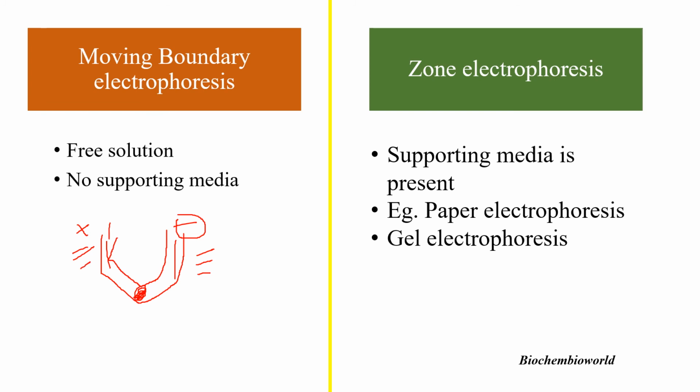Whereas in zone electrophoresis, a gel is used and the same happens, that is, separation of molecules on the basis of the charge to mass ratio.